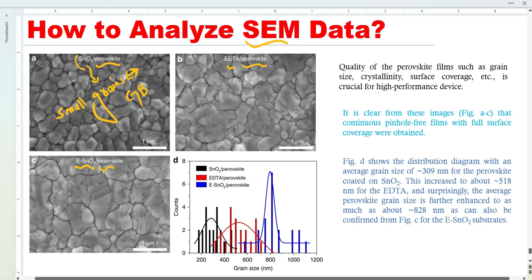There are a lot of grain boundaries which is detrimental for a device because there is mechanical instability, the fracture occurs, the moisture can enter through these grain boundaries, etc. But once we deposit this perovskite on EDTA, we can see that there is a significant change occurring to the grains.